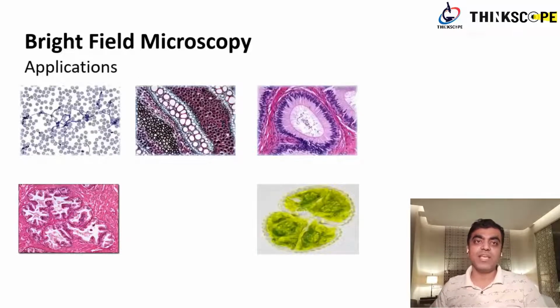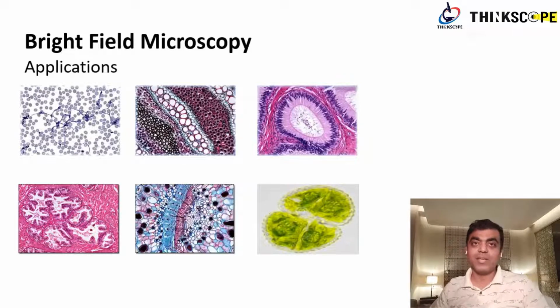Applications, if you see, there are lots of application areas which you can think of. You can use simple blood smears.